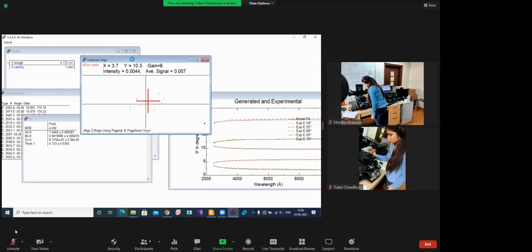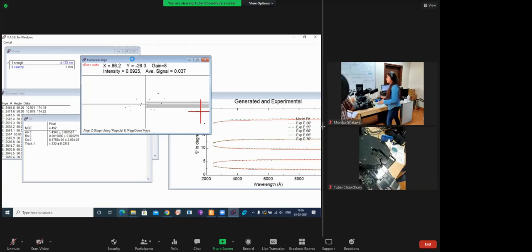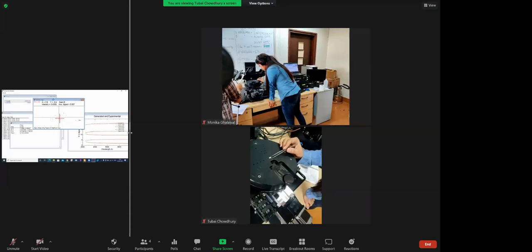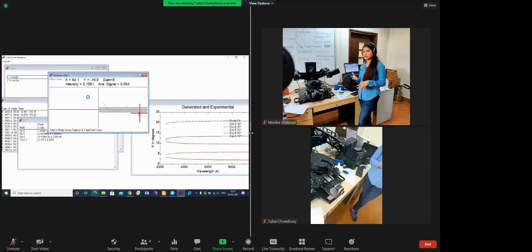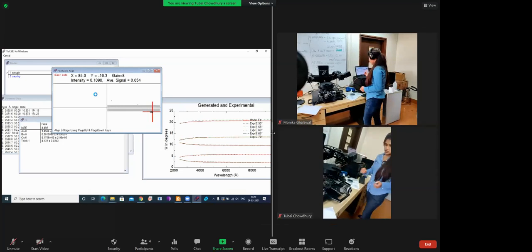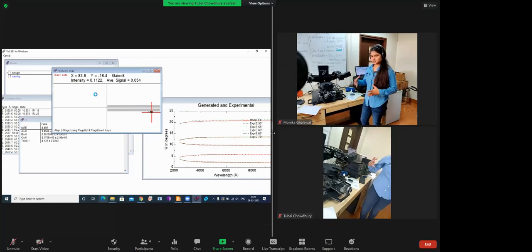and switch on our vacuum. Okay, this is the center. The alignment is a little complex in these cases. So this is at the center. Okay, I have started the alignment. In the hardware window, you just need to go to acquire data and align there. Now you have to check whether the white spot is there inside the detector or not.